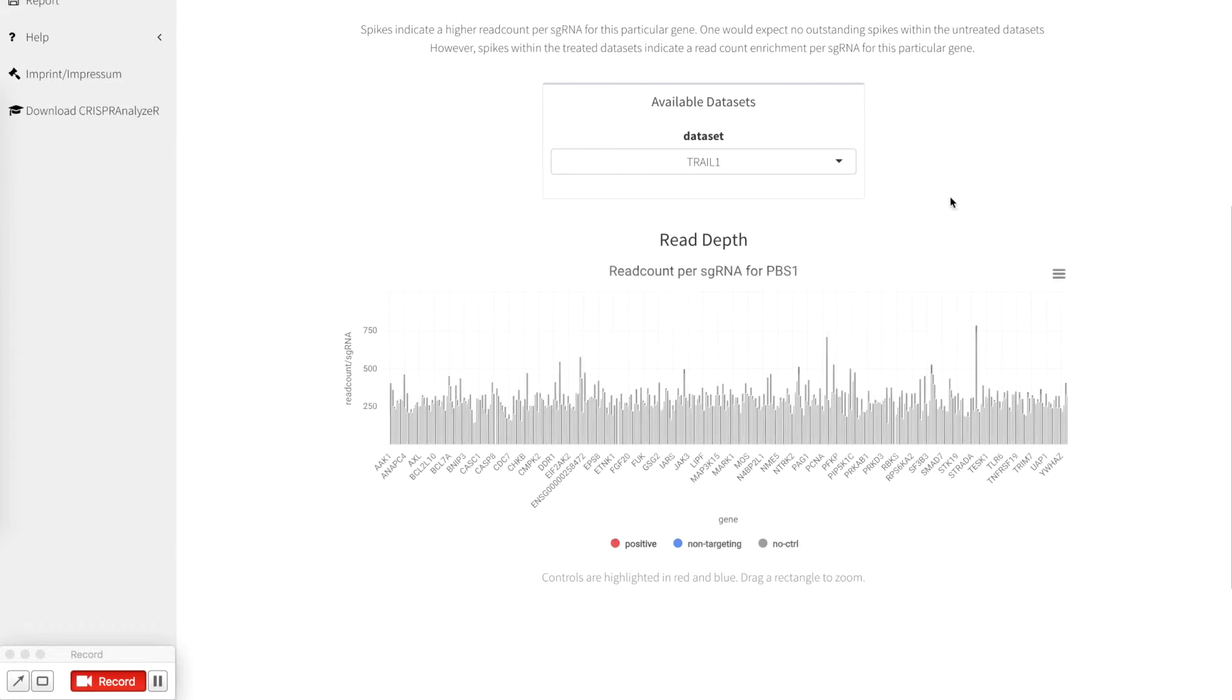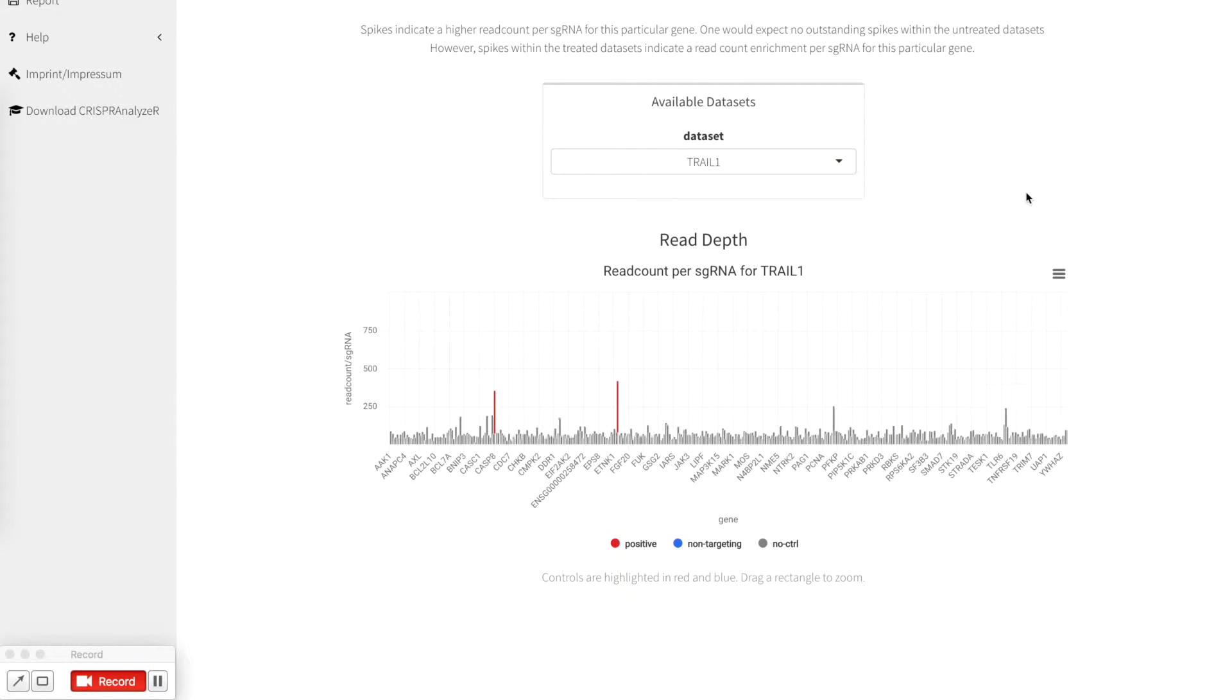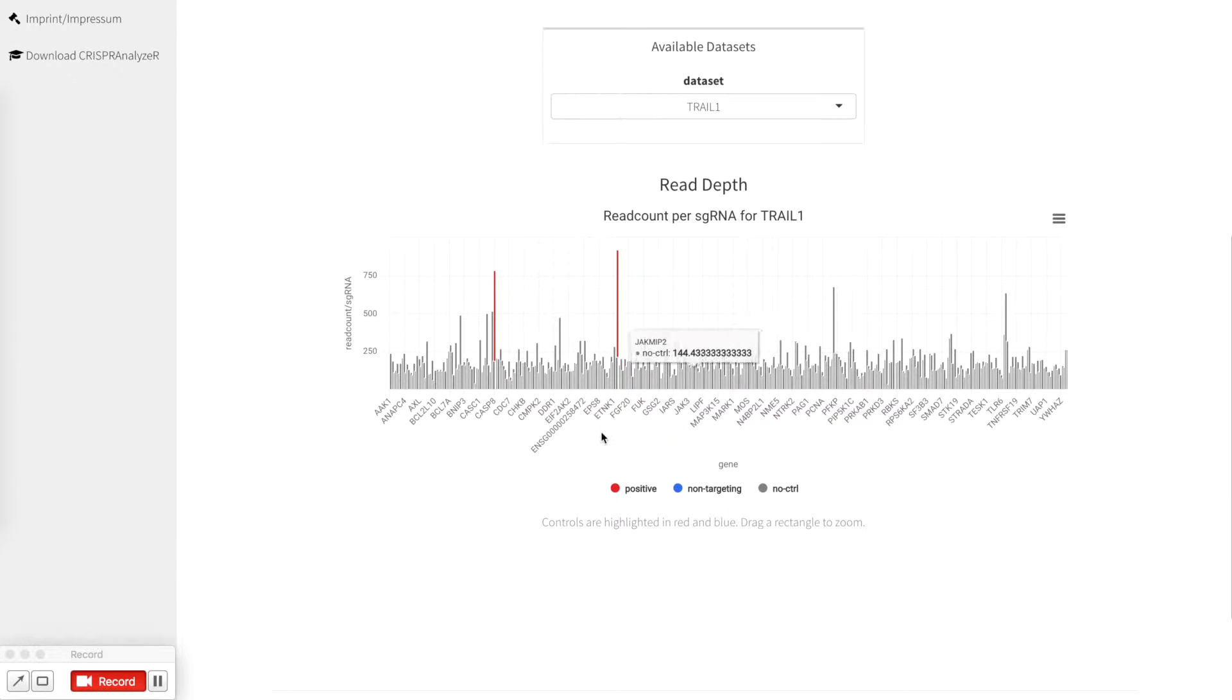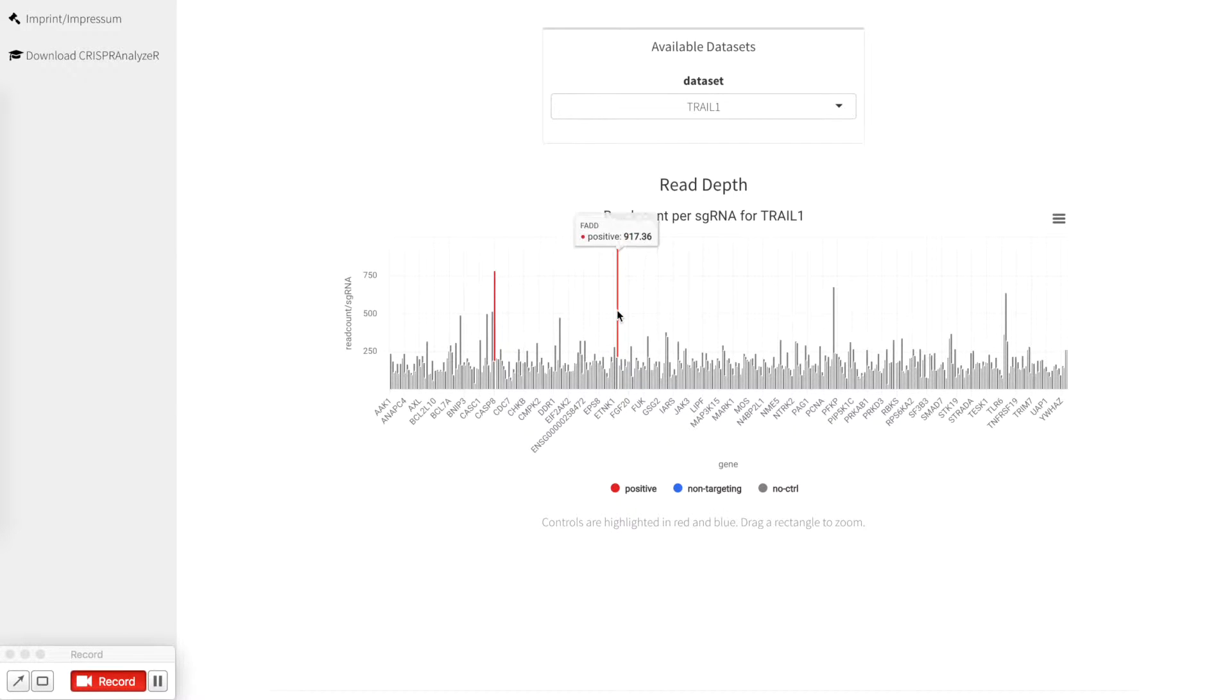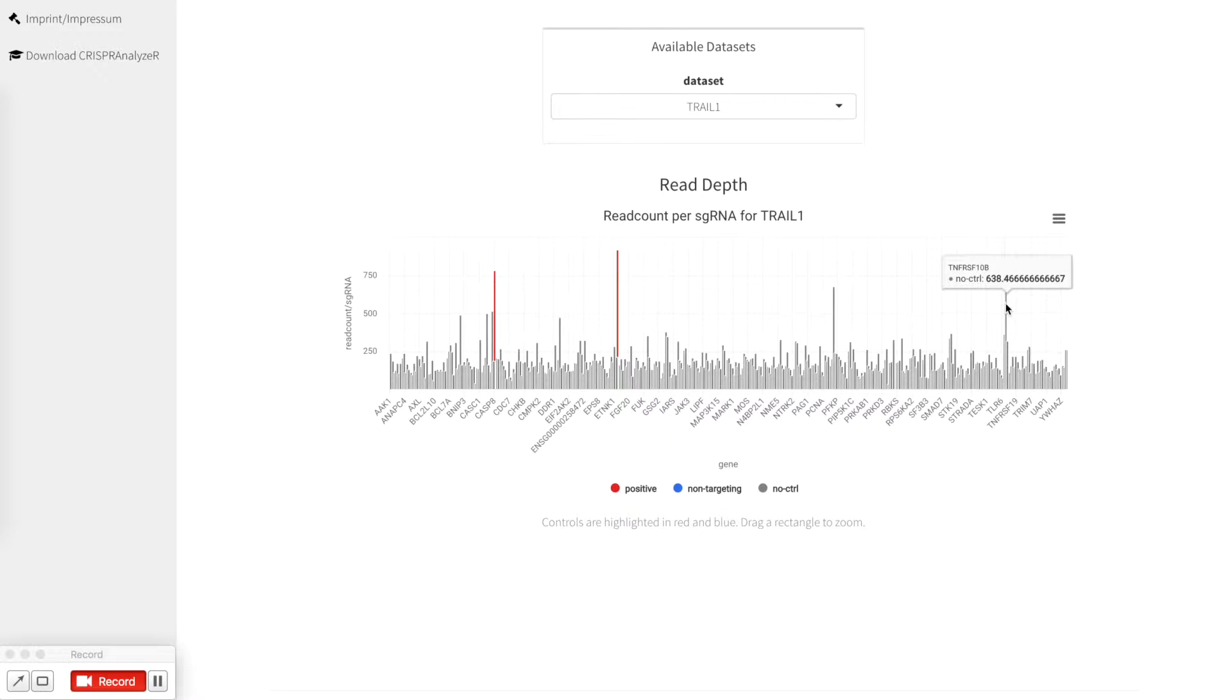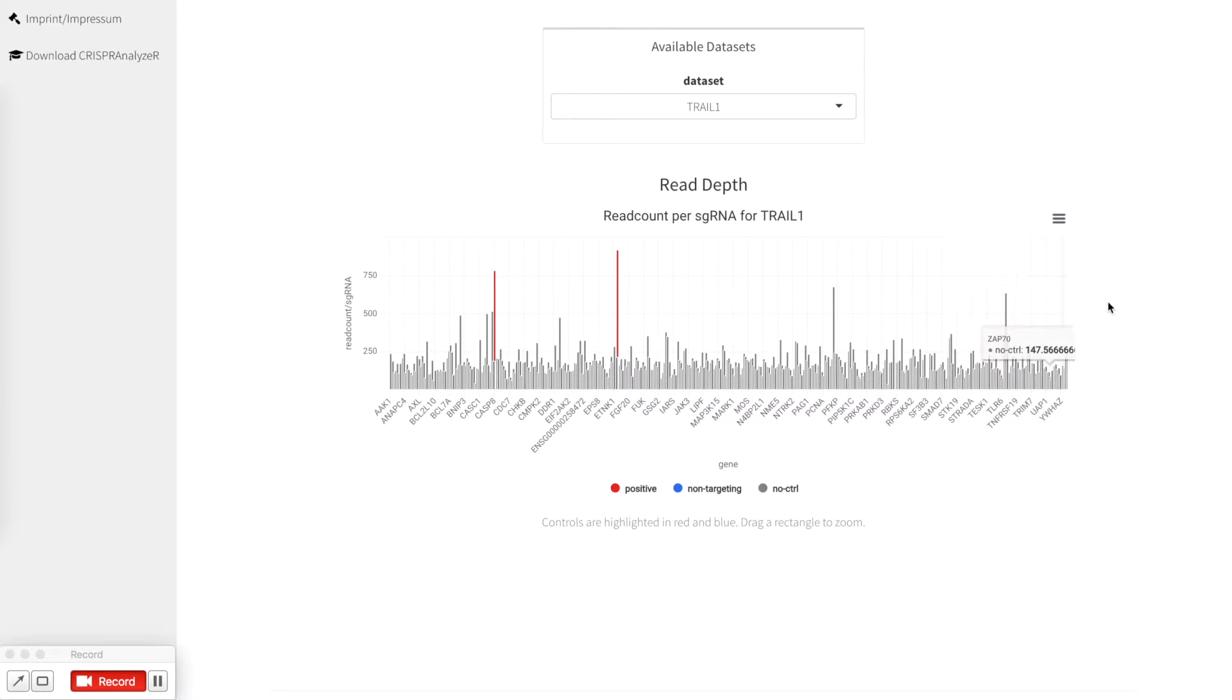For trail data sets that have been selected with a trail ligand, you can clearly see that the read count divided by the number of sgRNAs is really high for positive controls. You can also see that there are other genes showing up in addition to it. If you like this plot you can just download the plot as it is.